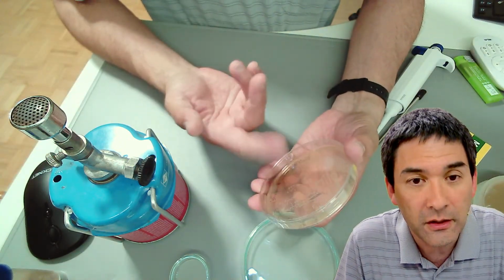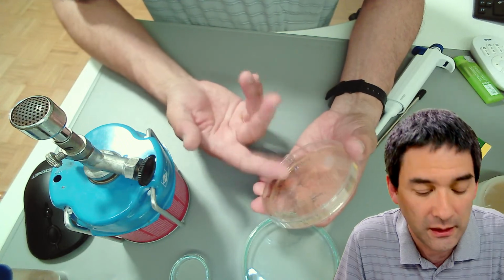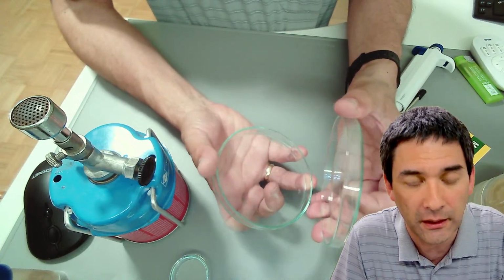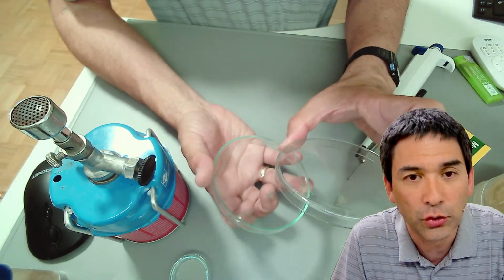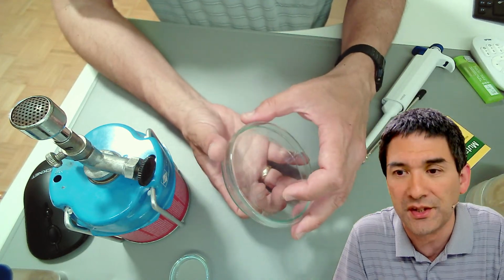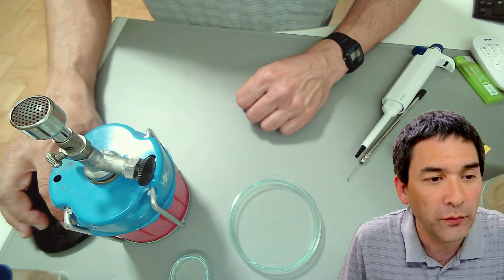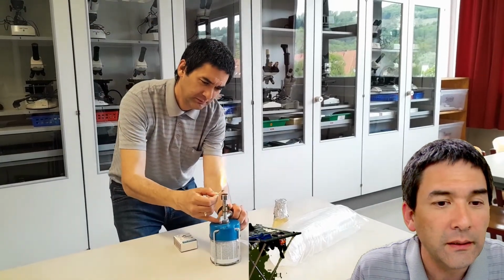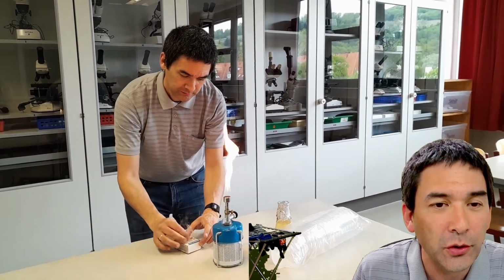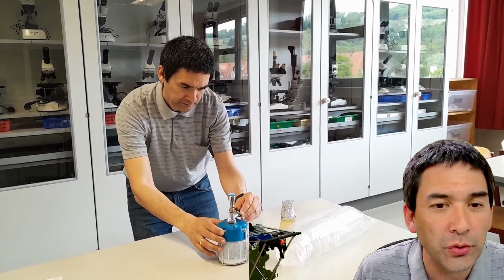The agar plates that I use here are disposable plastic petri dishes. Of course, there are also glass petri dishes available, but nowadays in microbiology you rarely use those because you want to use the disposable ones. So what I would like to do now is start off with a video. Here you see myself turning on the Bunsen burner, and I will occasionally pause it and show you what I'm doing.